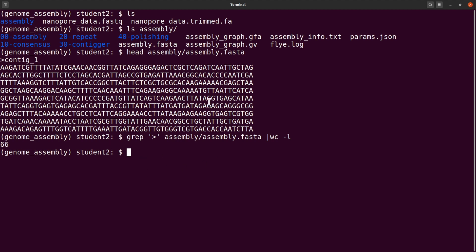So the purpose was just to get the genome assembly done, and now we have what we need here. We also did some polishing, so it has been very good. I believe this has been helpful, and you can now proceed to do your other work as well.